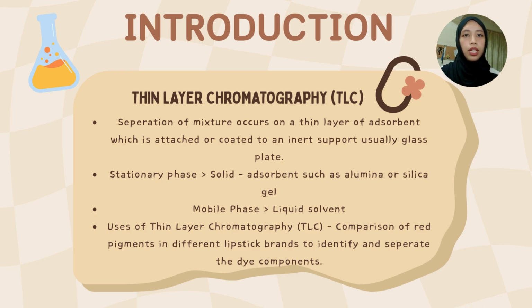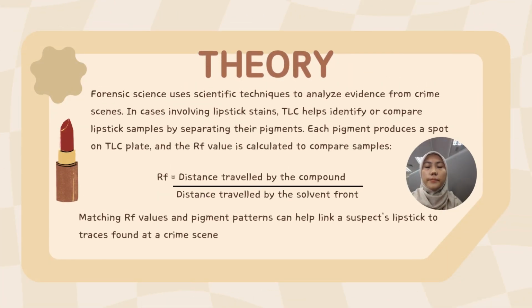In this video, we will explain one of the uses of TLC, which is to compare the red pigments in different lipstick brands. This helps us to identify and separate the different dye components present in each sample. Next is the theory. In forensic science, scientists often use thin layer chromatography to study evidence from crime scenes, especially when it involves colored or chemical substances like dyes, ink, or powders.